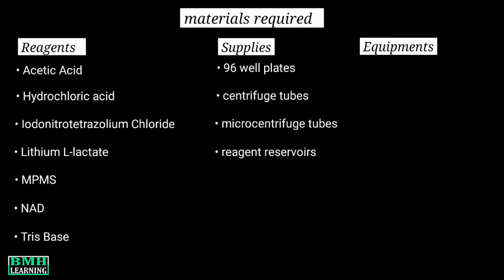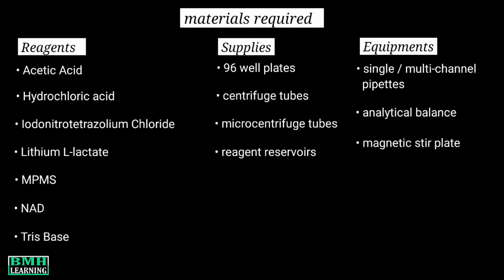Equipment needed: single channel and multi-channel pipettes, analytical balance, magnetic stir plate, pH meter, orbital shaker, plate reader for measuring absorbance at 490 nanometer wavelength.